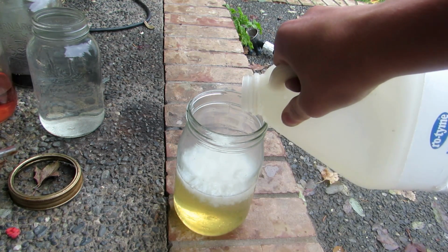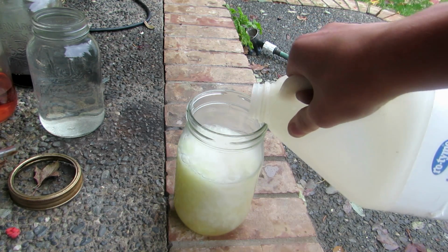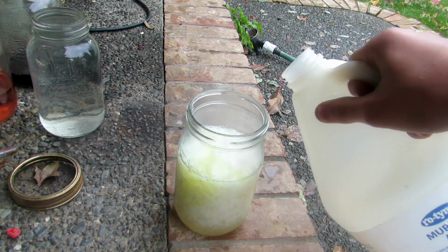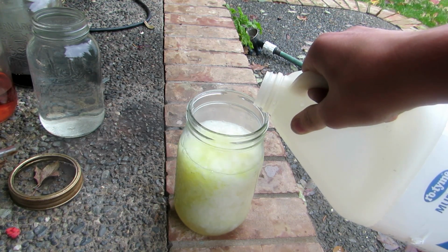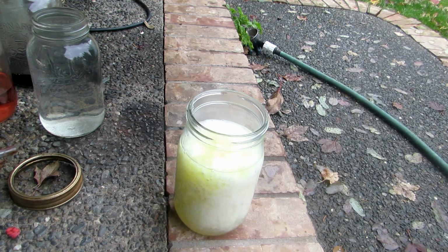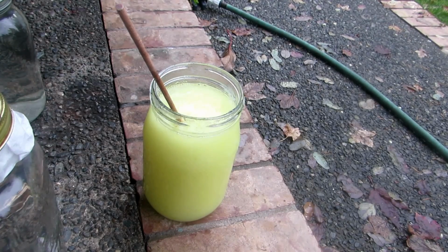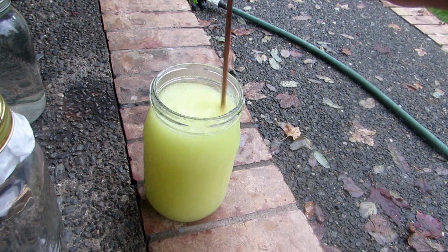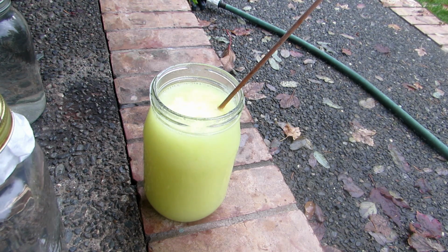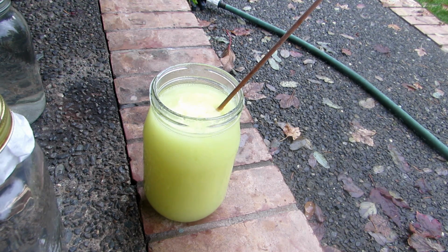So I'll add some more. And we're certainly getting a lot of silicic acid precipitant. I'll add a bit more and see. We did indeed get more. So I'll just keep adding this till it looks like no more precipitant is forming. And I'll meet you back after that. So after stirring, a vigorous amount of bubbles were produced and it almost boiled over, but luckily it didn't. And also all of our precipitant seems to have perhaps redissolved, or maybe just more of a suspension as I broke up the chunks. But nonetheless, the next step to do is just to filter it.